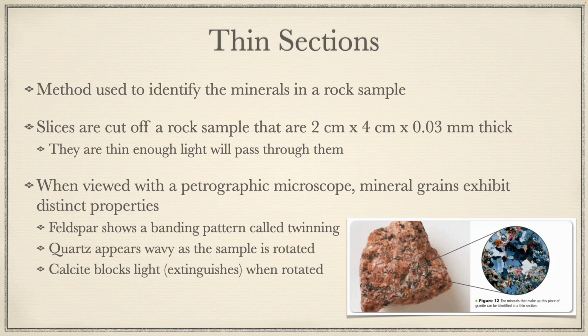this section. So again, the whole idea is you have this thin section of rock, you put it in a special microscope, and you move it around, and depending on what the mineral is, it changes the way the light goes through it. You can kind of use that to identify the minerals that are in that sample. And again, we kind of do this because it's really hard to use our standard tests when you have these tiny little crystals that are surrounded by other mineral crystals.